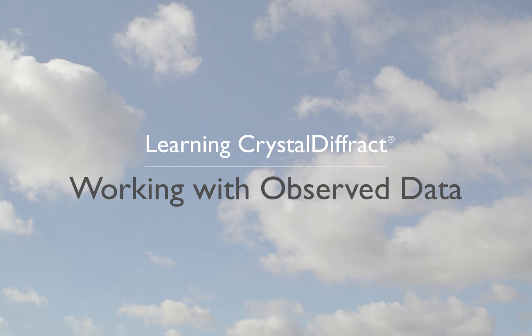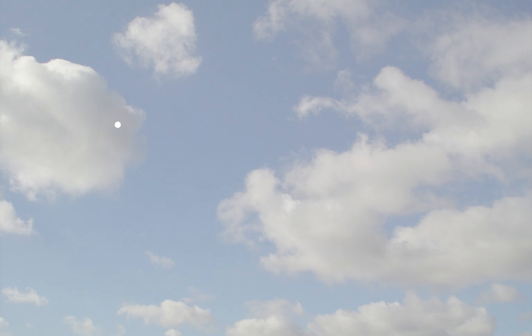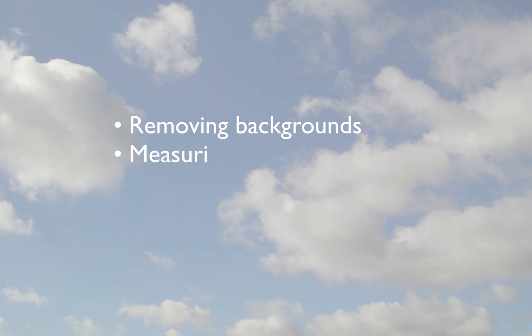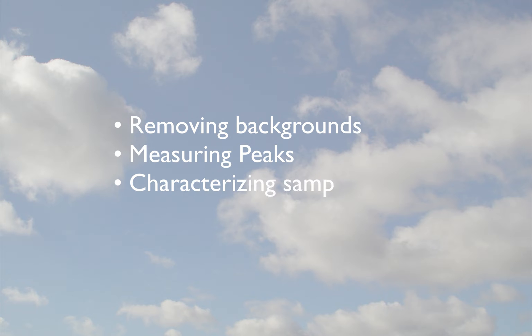Welcome to Crystal Diffract 7. In this tutorial, we'll explore how you can get more out of your observed diffraction data, including removing backgrounds, measuring peaks, characterising sample integrity, and performing phase ID.